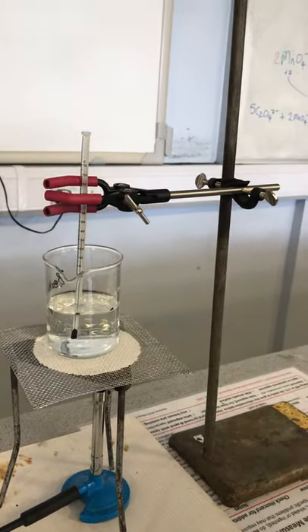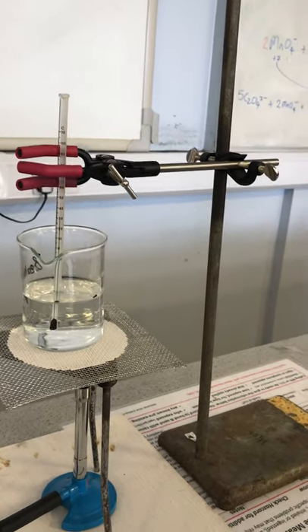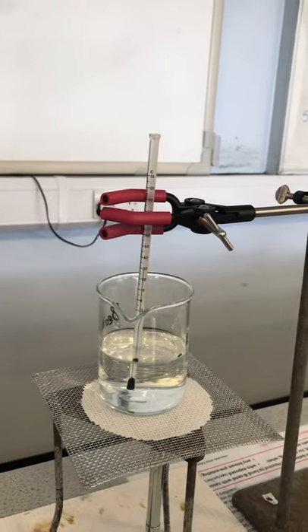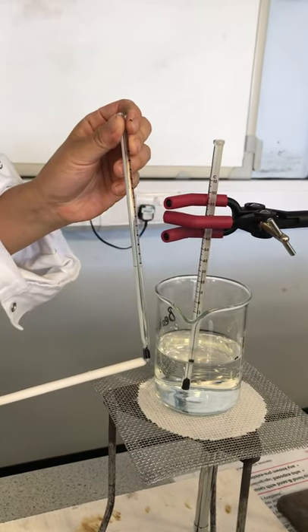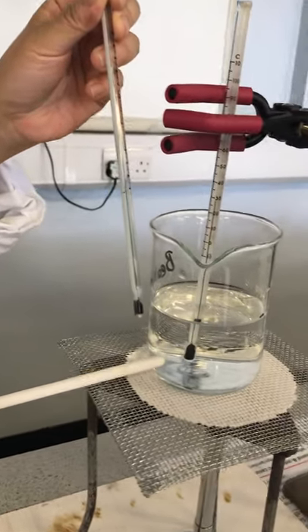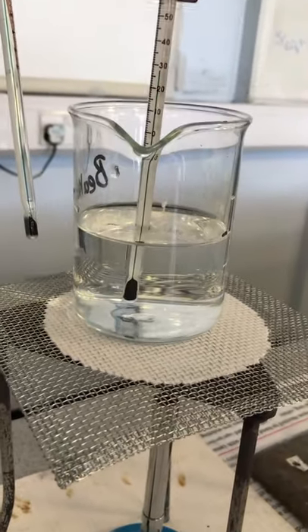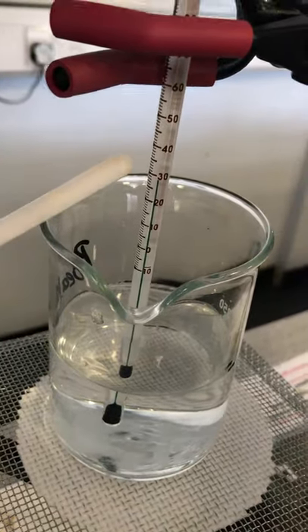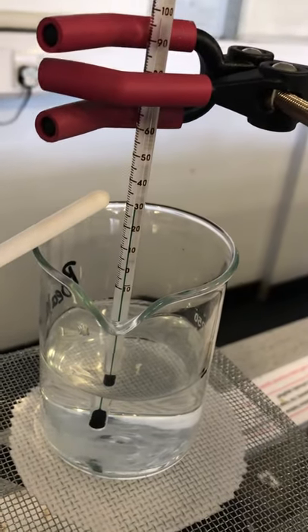If you want, you can use a clamp stand to hold the thermometer in one place and make sure the bulb of the thermometer is fully submerged inside the water. Now we take the start reading of the thermometer before heating the water.